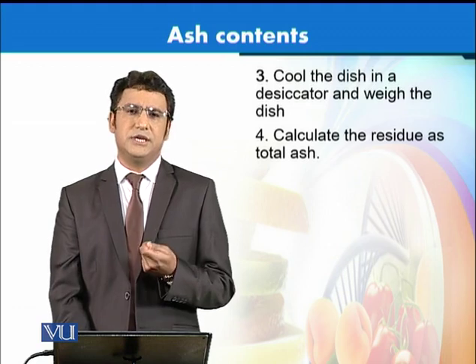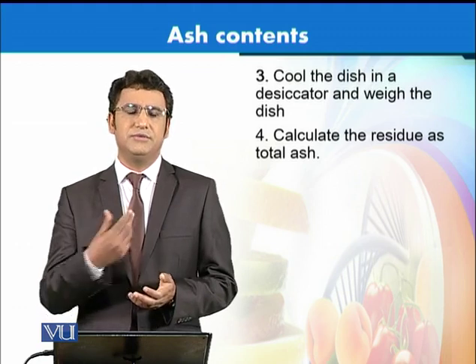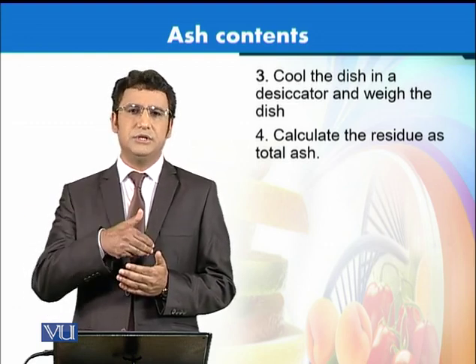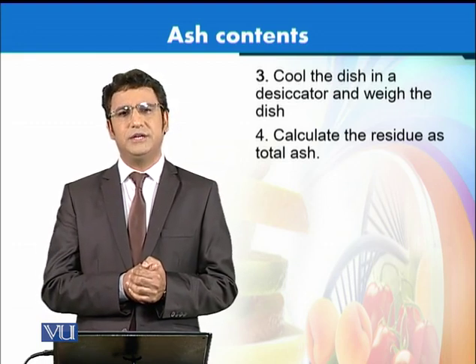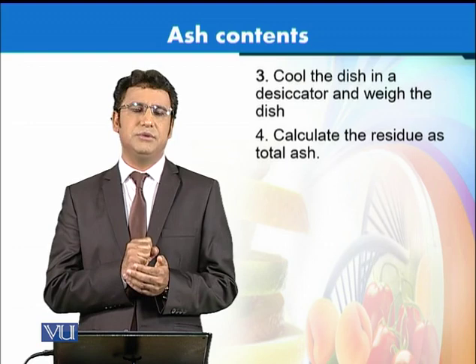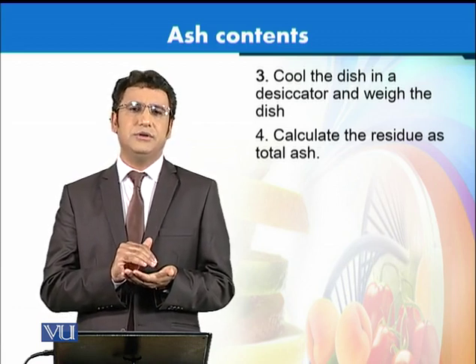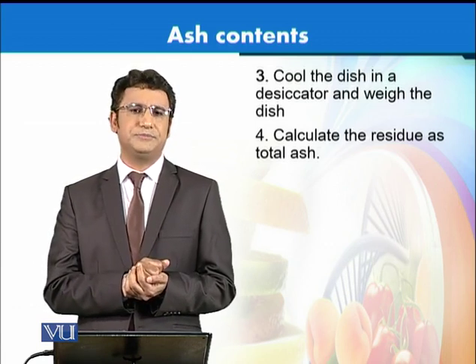As we discussed in the case of moisture analysis as well, once we take the silica dish from the muffle furnace, we cannot weigh it directly, because there are chances that moisture would condense from the environment onto the dish, adding a slight weight to the dish. That might introduce some error in the food analysis. So rather than directly weighing the dish, we place this silica dish into the desiccator, normally for some time until it reaches normal room temperature.